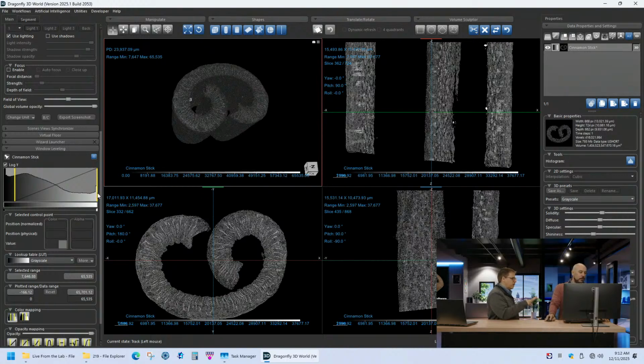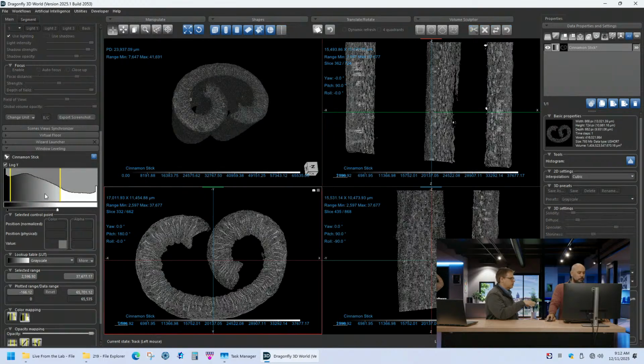Now on the left, I noticed you were clicking on that histogram, and you're able to change the way it looks or the color. Yeah, this is like your standard histogram that you'd mess with in any visualization software. For people who are brand new to the technique, when we say histogram, because we've said that a lot, what is that actually showing? What's that graph mean?